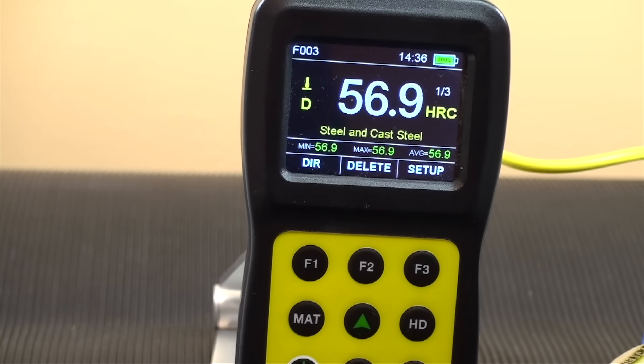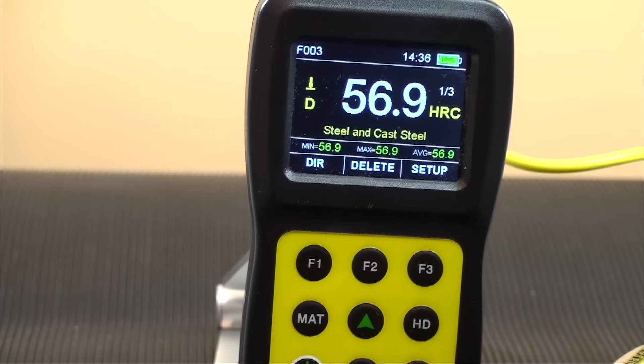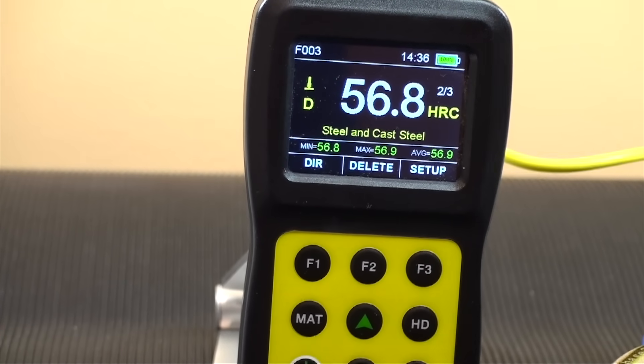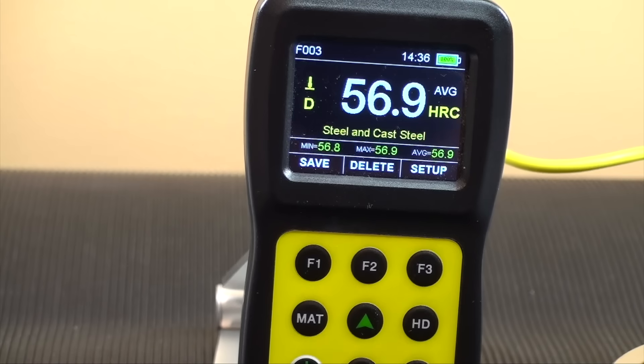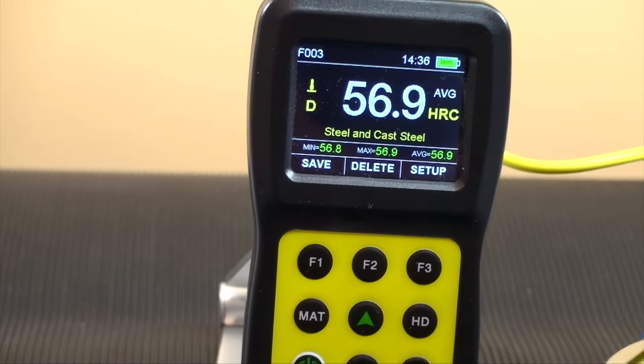The count number will revert back to zero once you have reached the number of tests to take an average. At that time, the average will be shown on screen. Taking a series of quick burst tests is rather simple and easy.